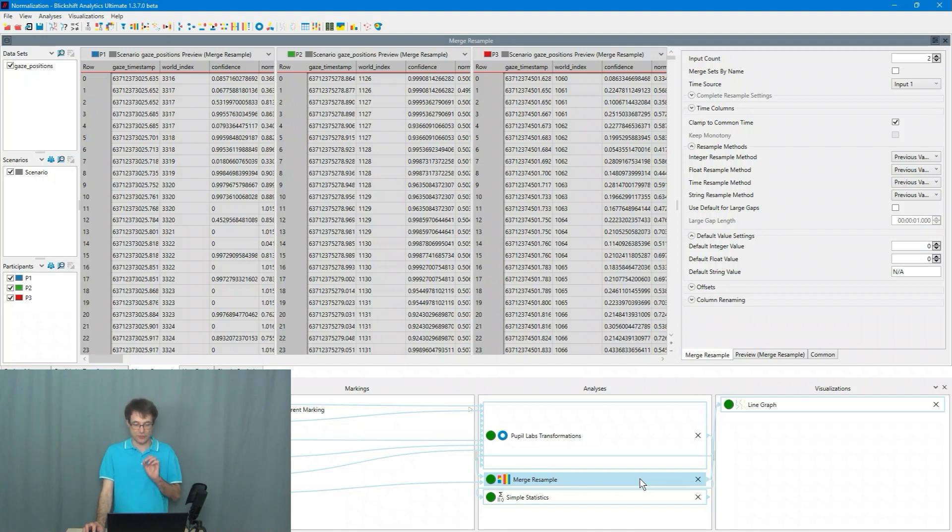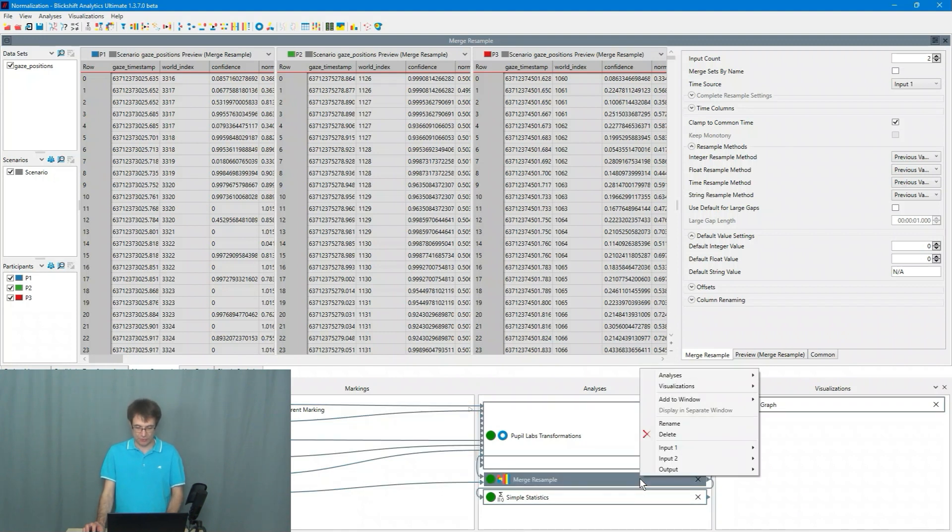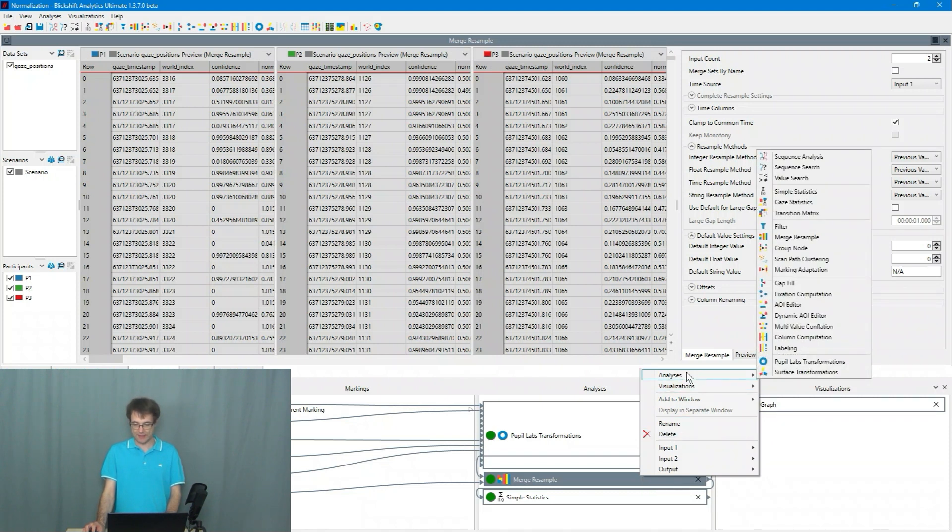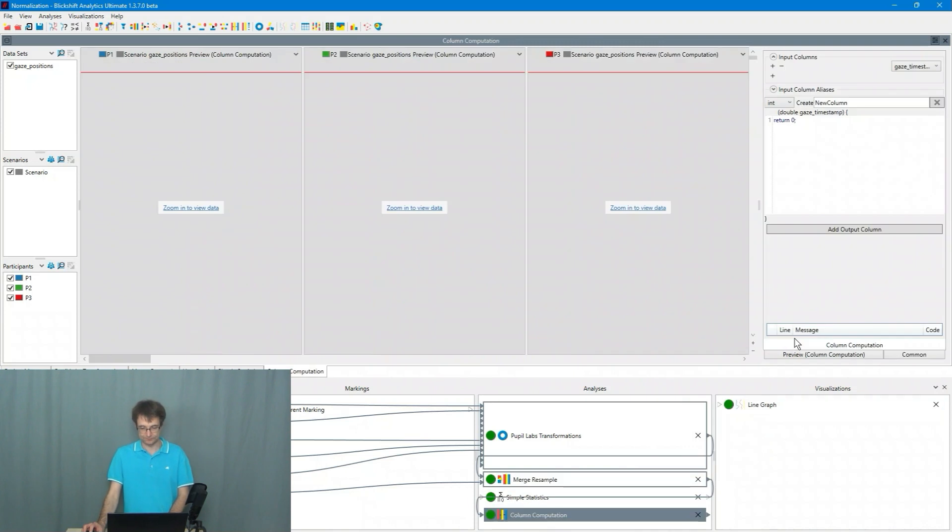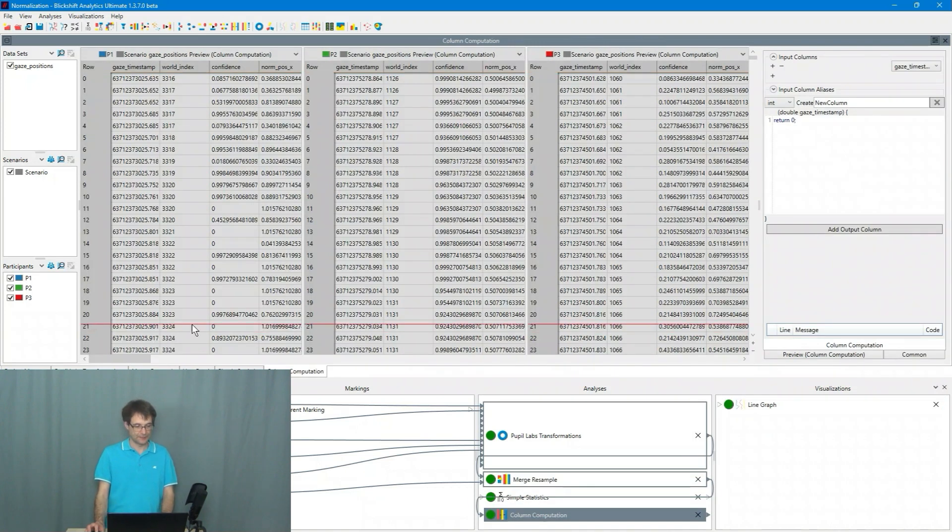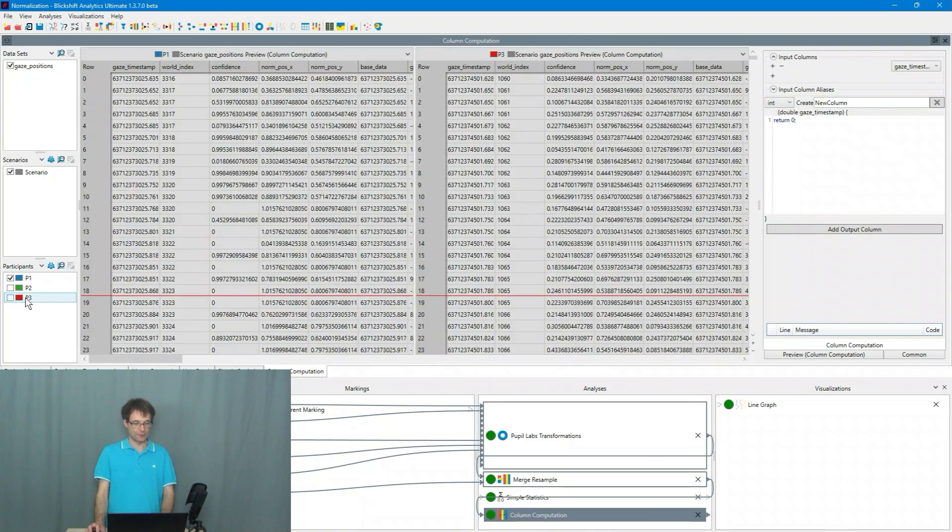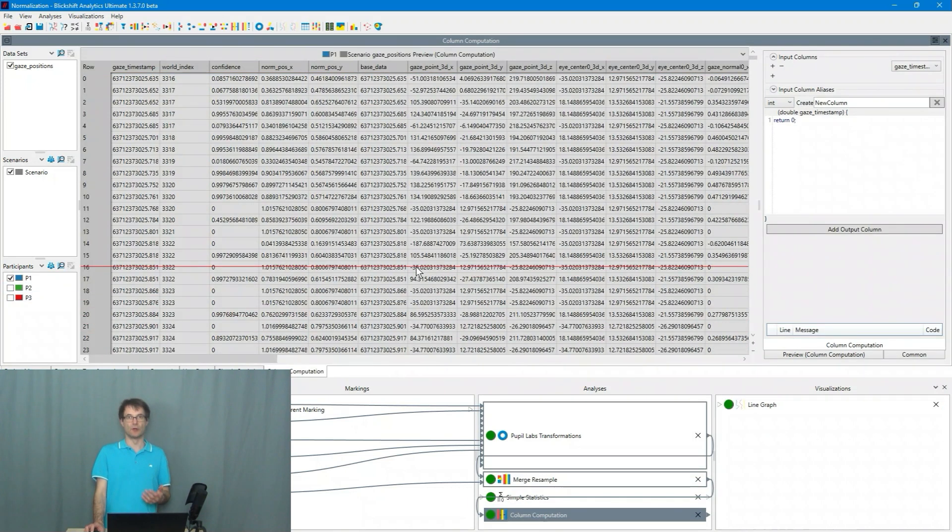For the normalization I will use the column computation. So I click here on the merge and resample node and I say analysis column computation. I select only P1 because we will do the normalization only for P1.